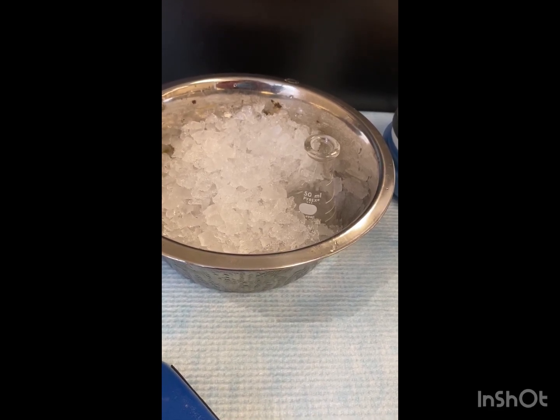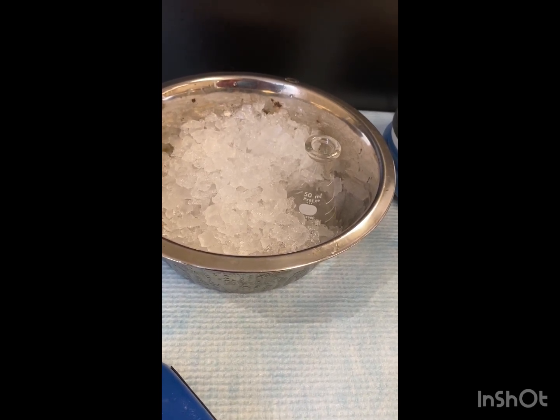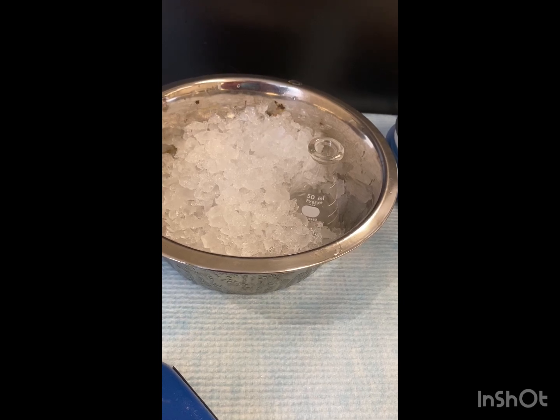Once this is cool, we're going to add 2 mole equivalents of sodium hypochlorite. So we need to figure that out, and we're going to do that right now.